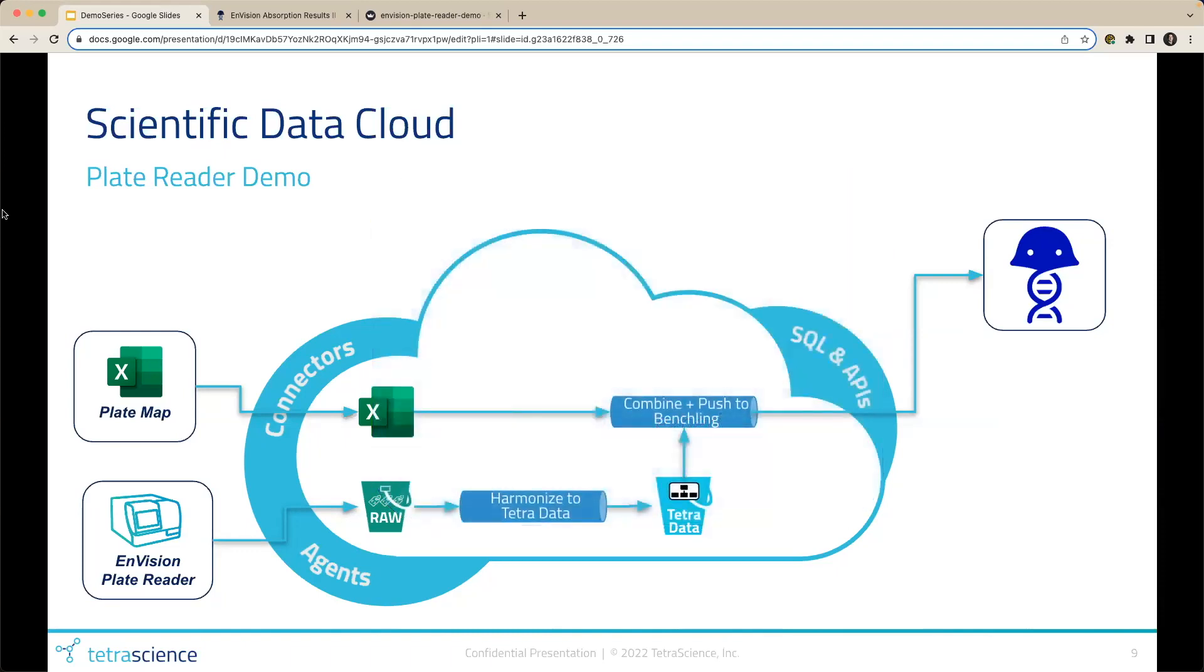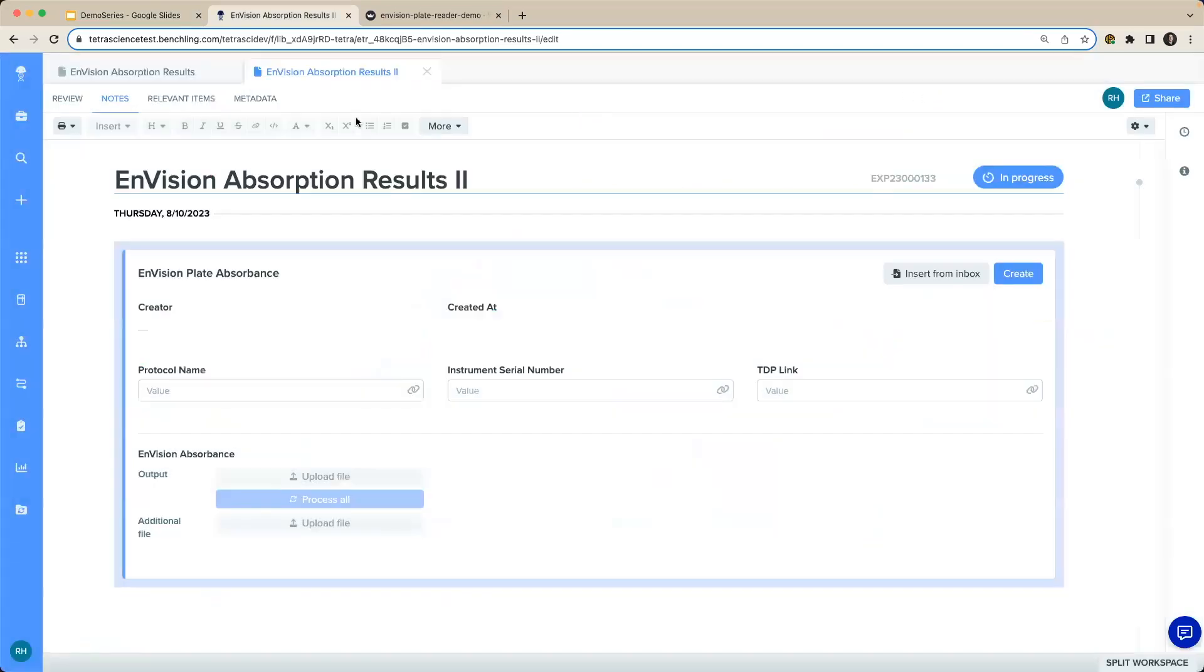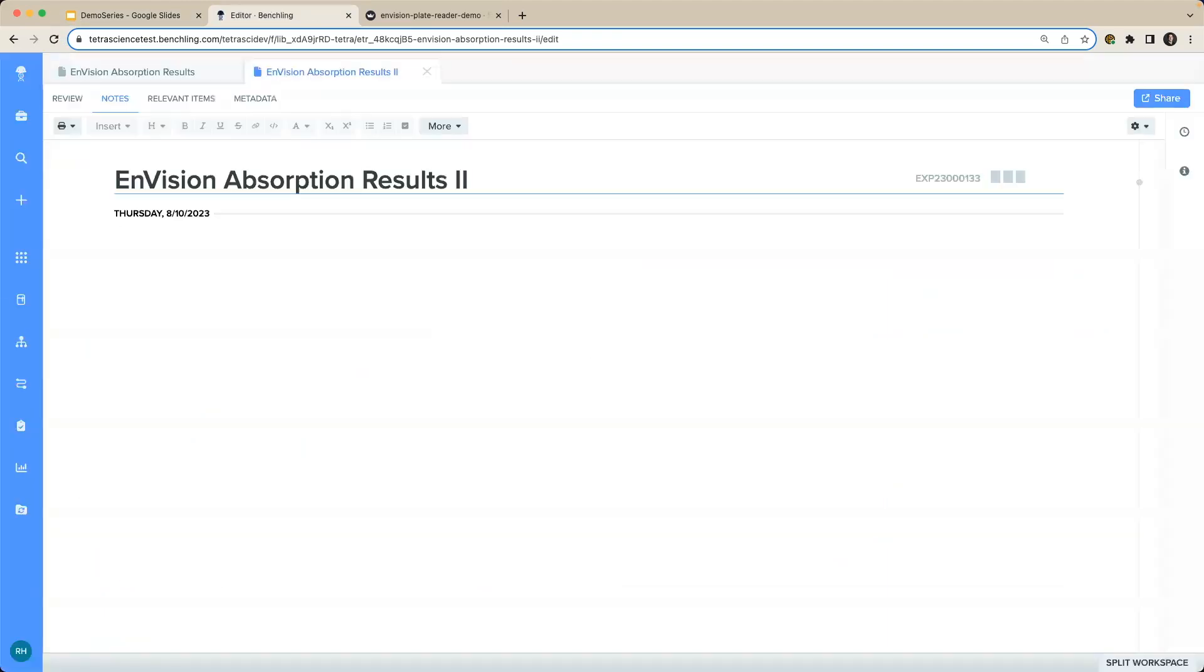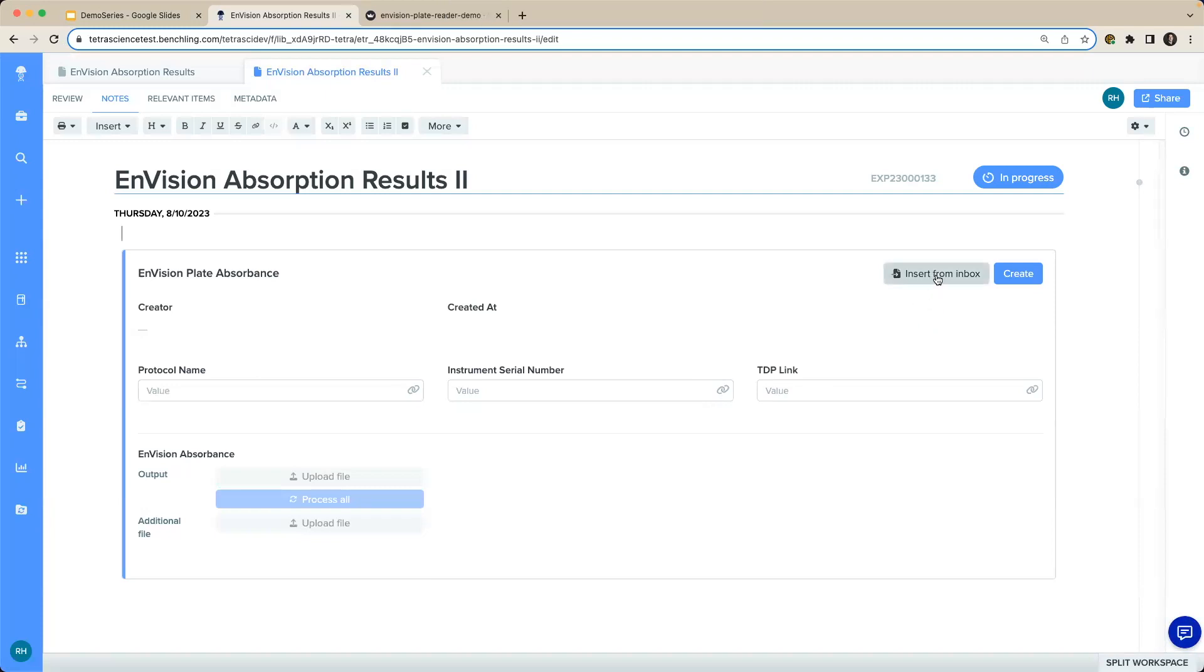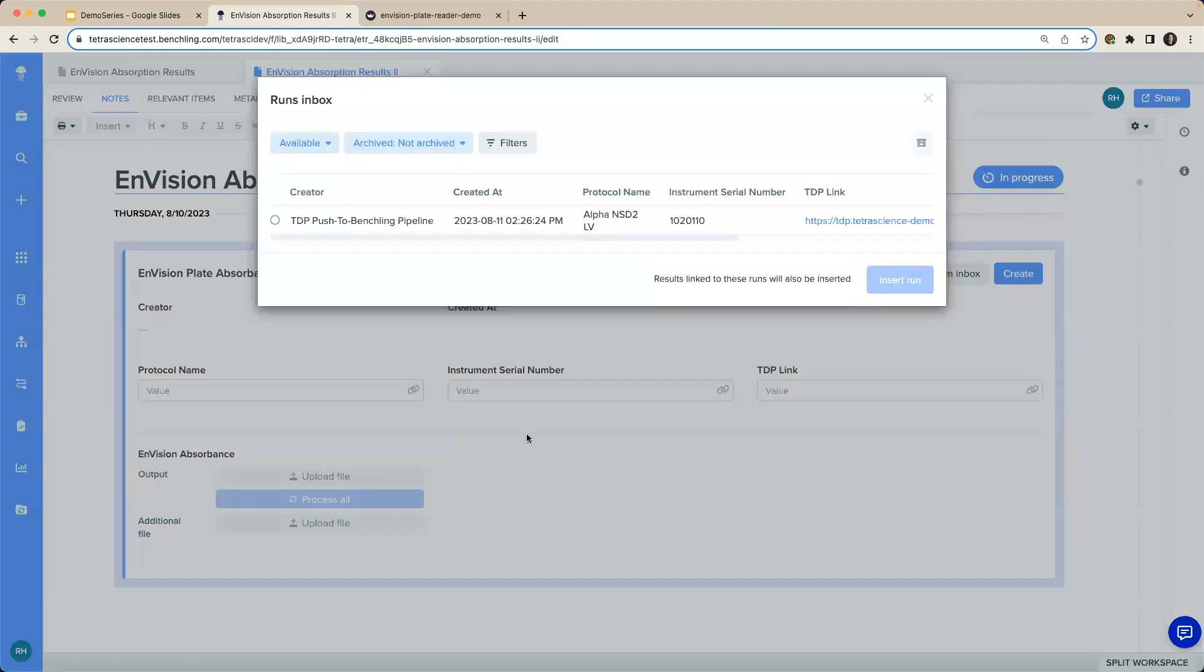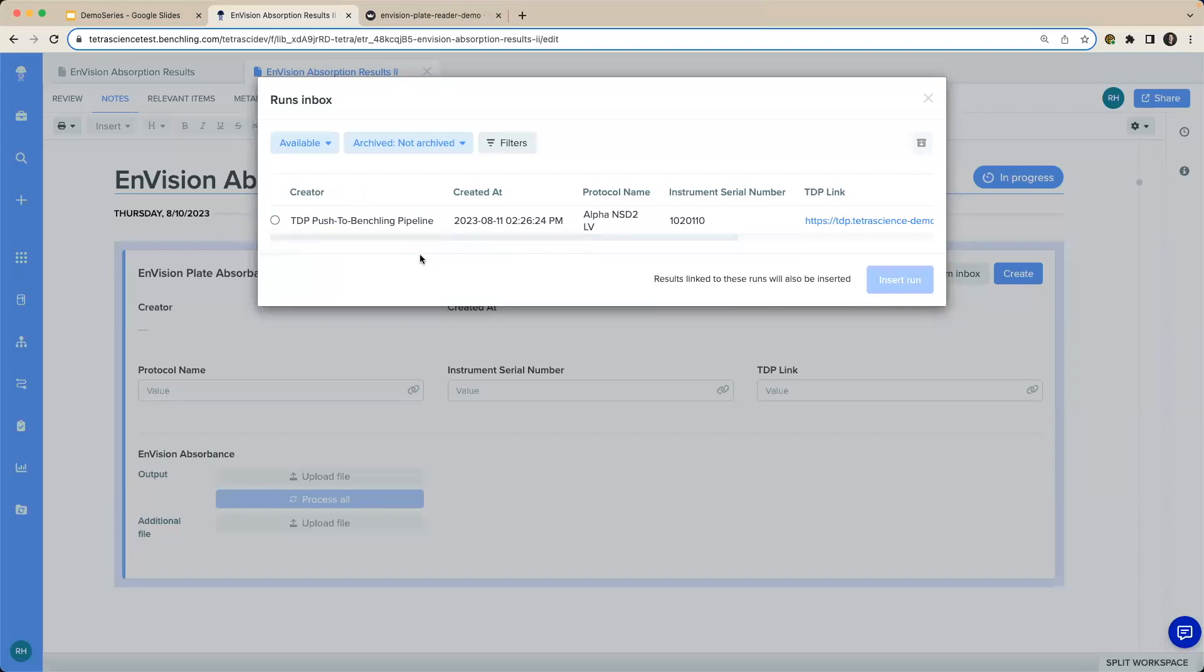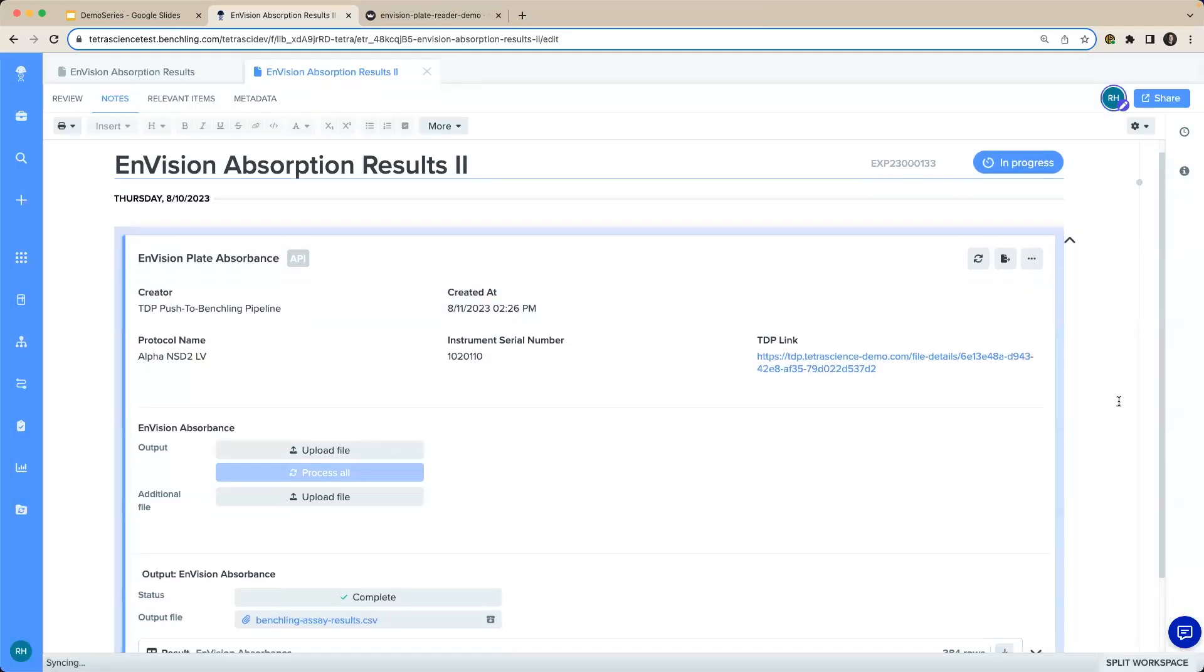Now we'll jump back into Benchling. Let's see if we were able to successfully automate the data being populated into the Benchling inbox. I'll refresh my page. Select Insert from Inbox, like I did previously. And like magic, we see the platform has pushed the data to our Benchling inbox available for our scientists. So I will select and I will insert this run into my Benchling notebook.